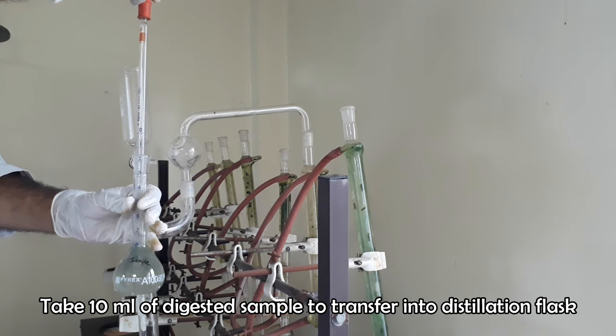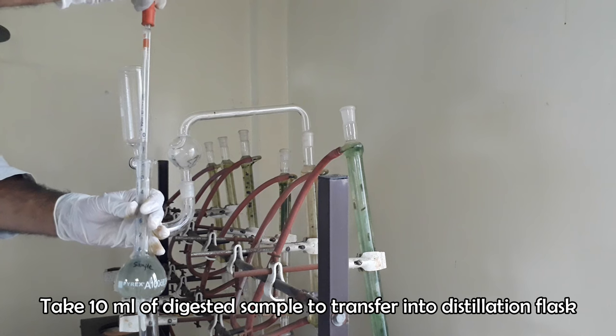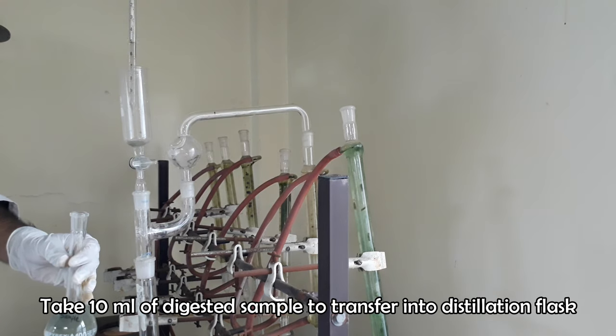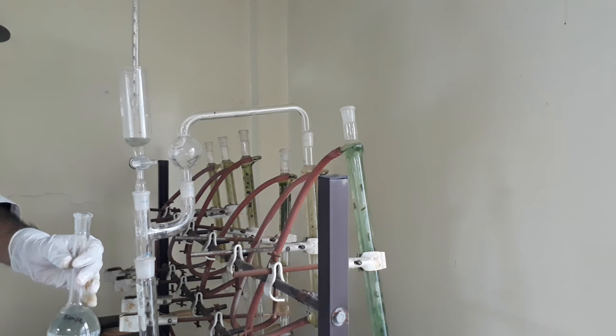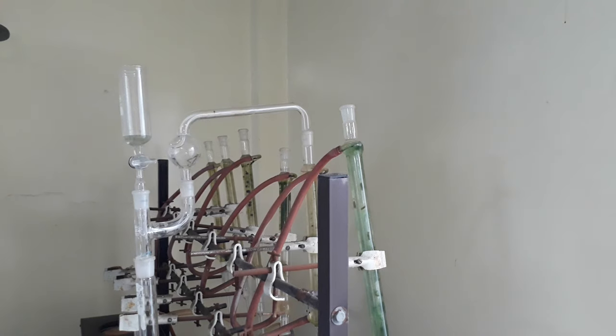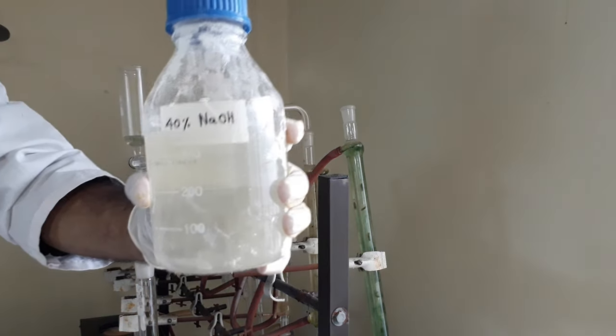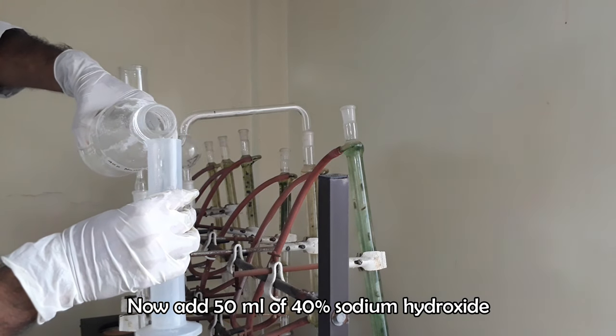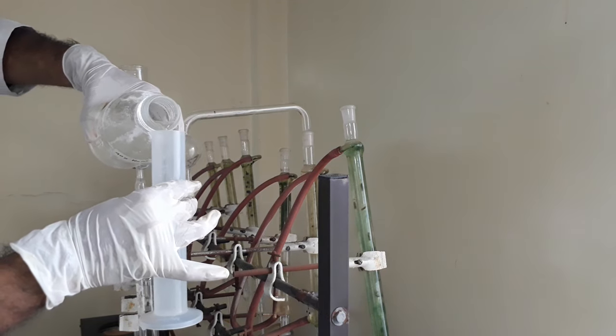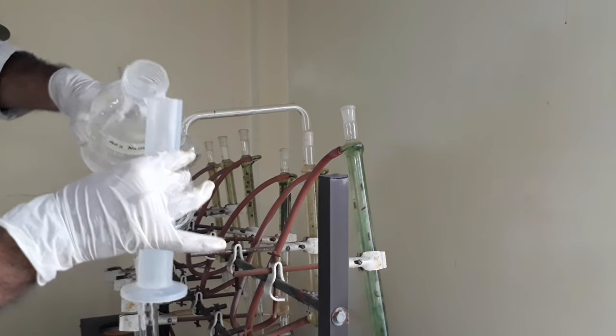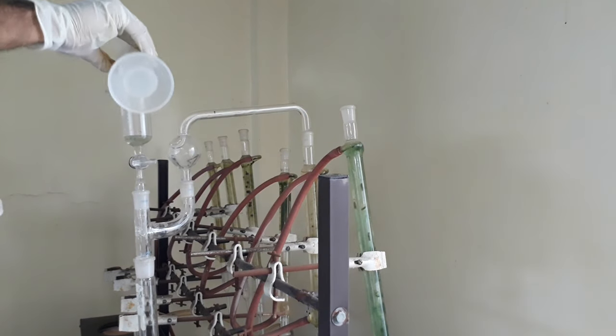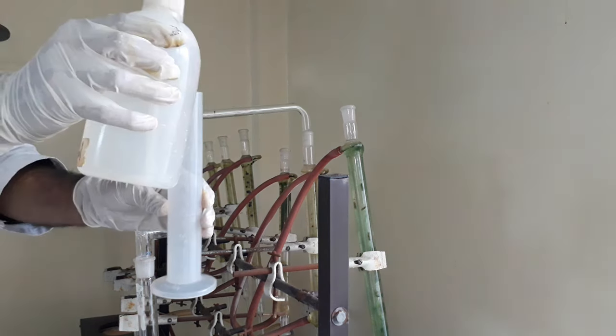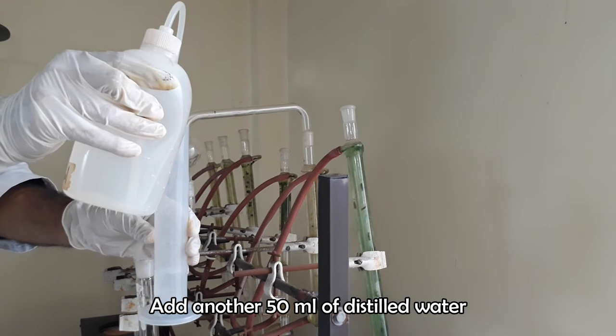Add 10 ml of diluted digestive juice to the distillation flask. Now add 50 ml of 40% sodium hydroxide. Finally, add 50 ml of distilled water to the distillation flask.